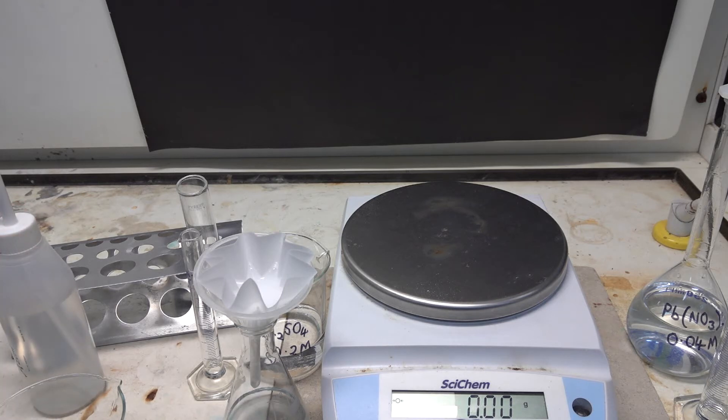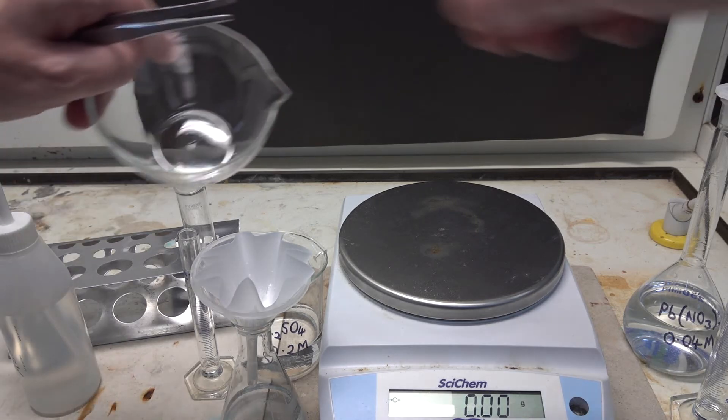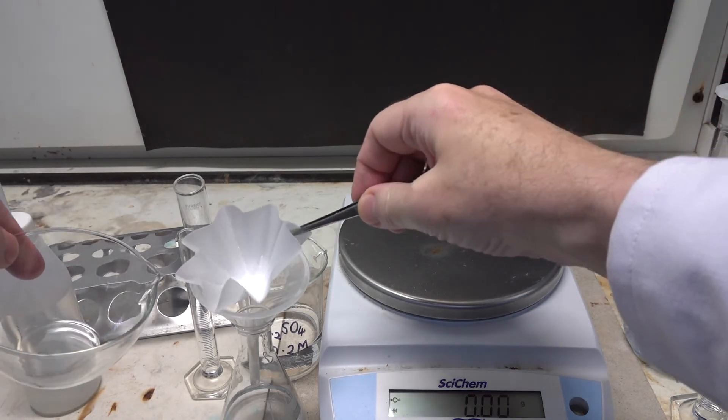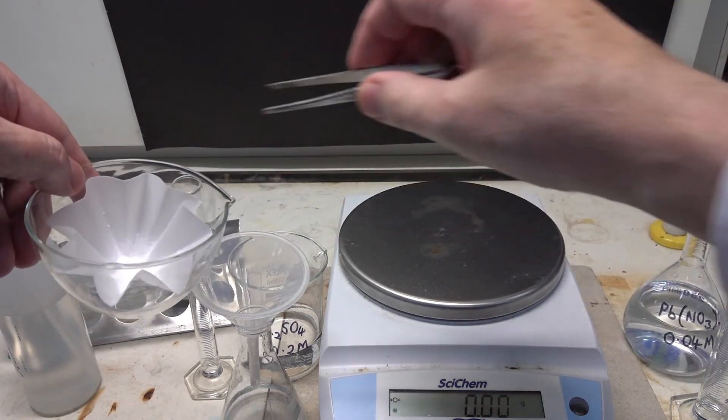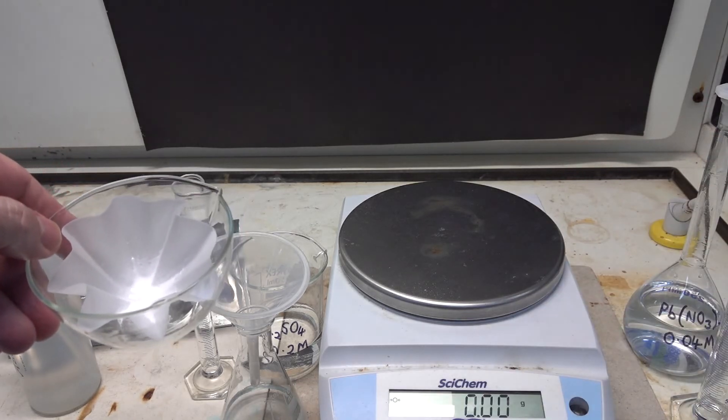Once more we'll pause the video whilst that filters through. Now that the precipitate has finished filtering, the last thing we need to do is to transfer the filter paper to the evaporating basin and then place that in a drying cabinet to dry and remove all the water.